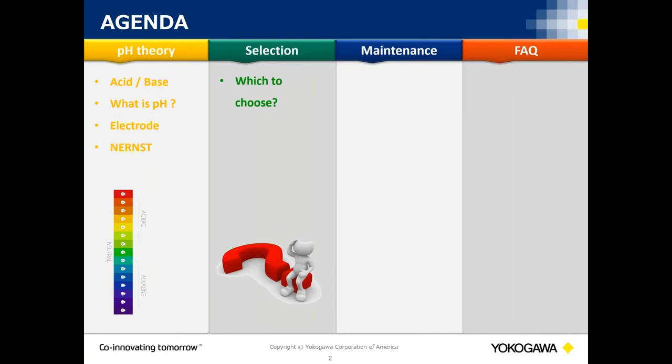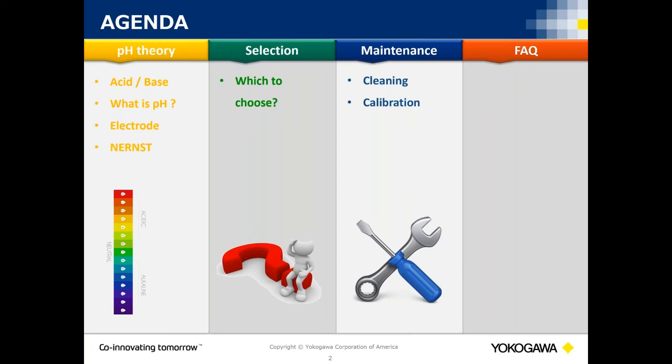When you talk about pH, it doesn't matter whose equipment, there are all different types to consider when picking the right pH sensor as well as the reference side of your sensor. So we're going to go into what to look for so that you can go back to the process and look, this is what I'm measuring. Maybe I don't have the right stuff if you're having issues. Because if we don't have the right equipment, we've learned that our equipment actually becomes a maintenance headache for us.